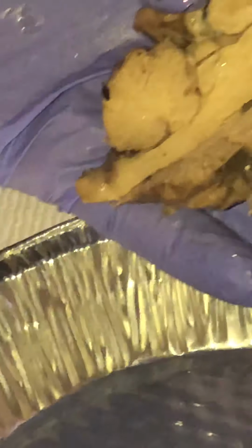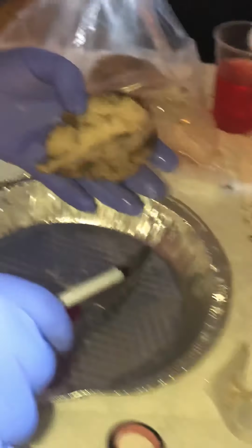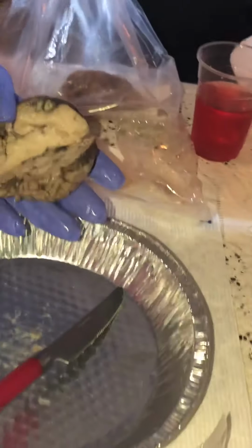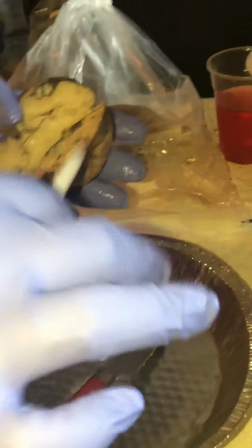Oh, thinking, duh. It's the thinking part of your brain. The two hemispheres are connected through the corpus callosum, and that's the cerebrum, which is the thinking part of your brain.